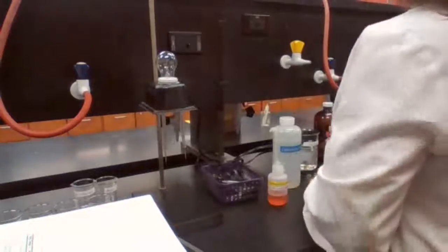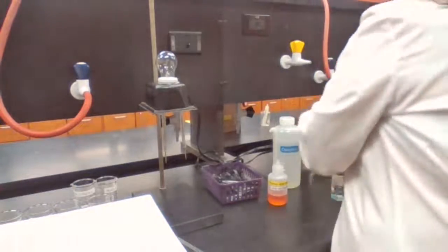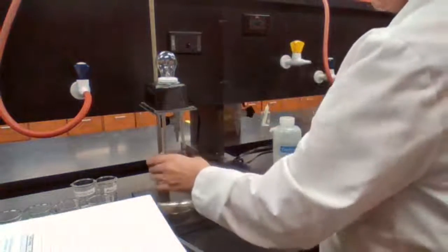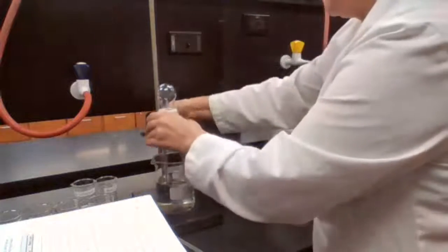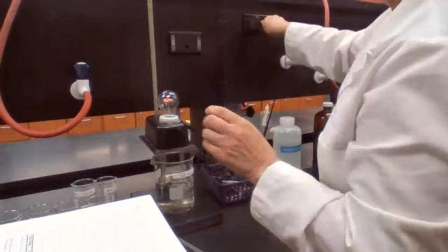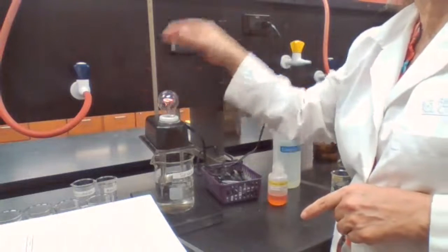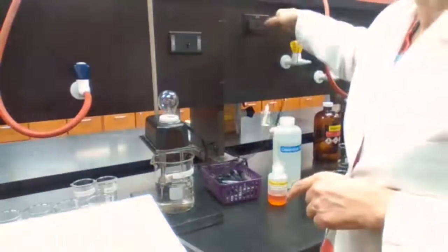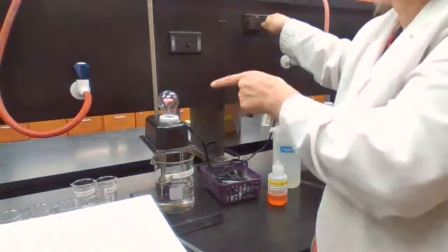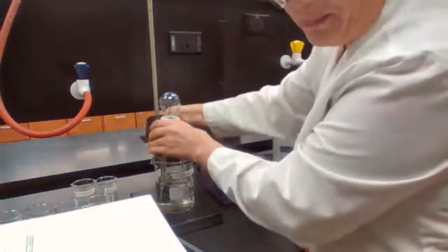Next, I have the tap water here. I'm going to use this tap water and see if it's going to conduct electricity or not. Okay, it does conduct electricity. I don't know if you could see or not, so I'm going to unplug and plug back in. It's a very dim light, meaning that it's a very weak electrolyte, because it's tap water.